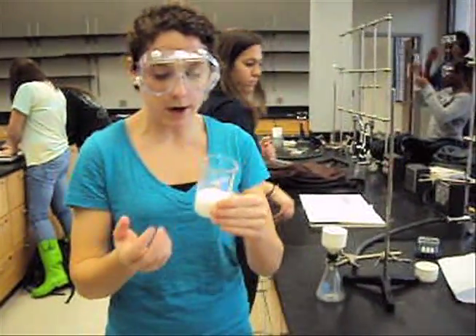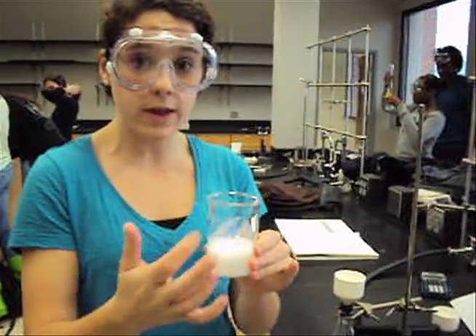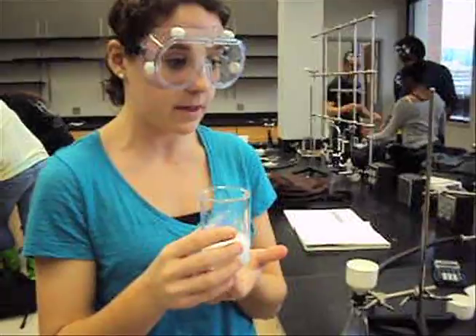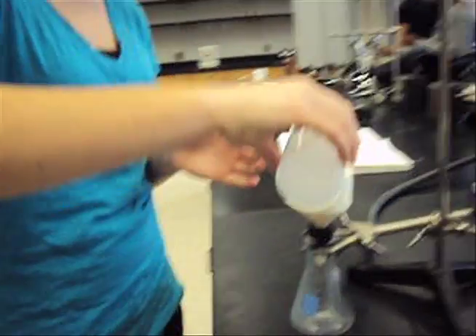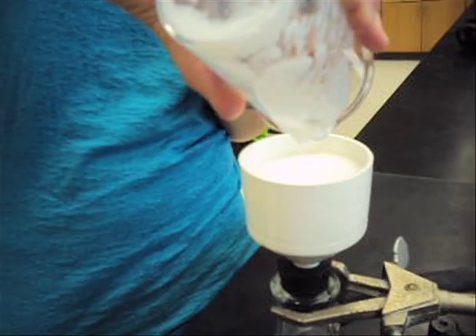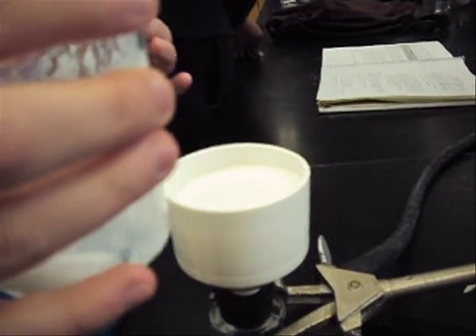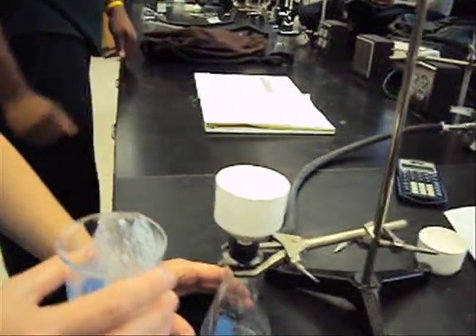I want to demonstrate how to properly pour what you're filtering into the filter. What you want to do is quickly swirl this to get the precipitate off the sides, and then pour it in so that you can get as much of the precipitate as possible. We're going to turn the vacuum on — and there we go.